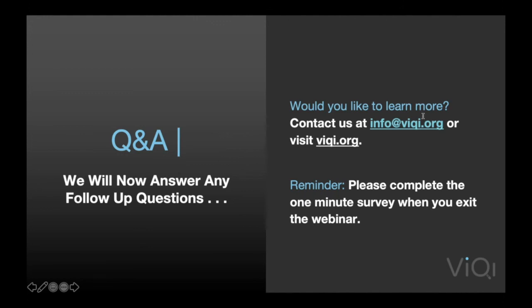Thanks, Ilya. Let's try and fit two more questions in. Demir says, in a feature-based AI, can adding too many features cause poor classification performance? So the thing is, the short answer is no.